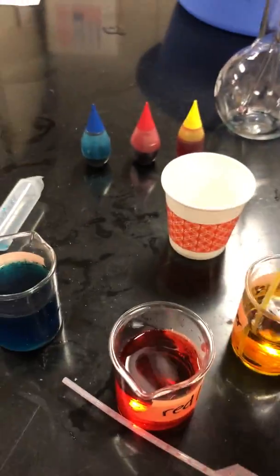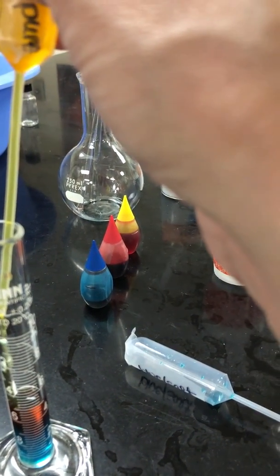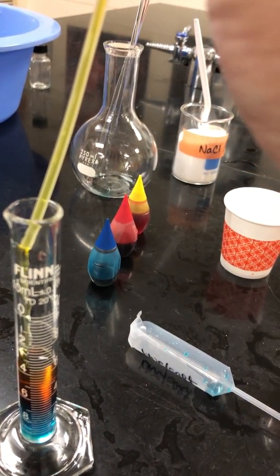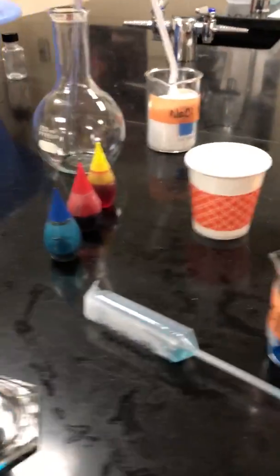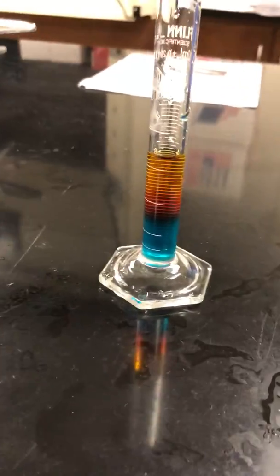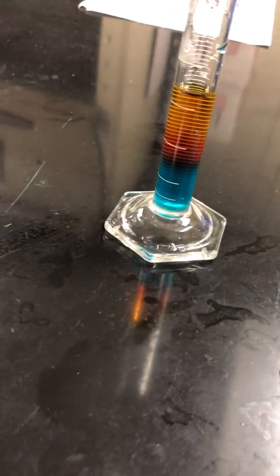And now, pure water. Hopefully you're predicting. You're like, well, you didn't add anything to it, so it should be the lightest, if you will. And your teacher will talk to you about the terms. Okay, back in. And seriously, come on. Tell me that is not one of the coolest things you've seen today. Beautiful. All right, and then you're going to draw and clearly label.